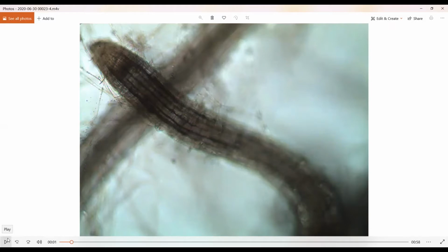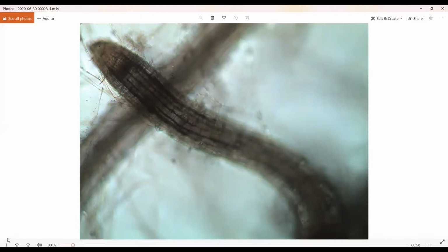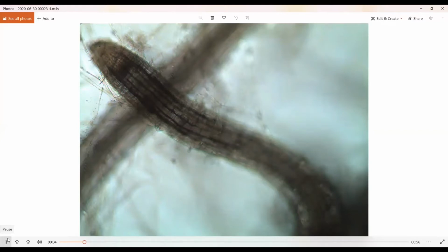occurring. So remember, in stems, branches form at specific regions called nodes, and the regions between nodes are internodes. This is not what happens in roots. In roots, the branch roots or lateral roots form wherever the root decides to put them, and this is dependent upon what kinds of nutrients are being sensed by the root. So let's see what it looks like. Oh, by the way, this is a magnification of 100x total.